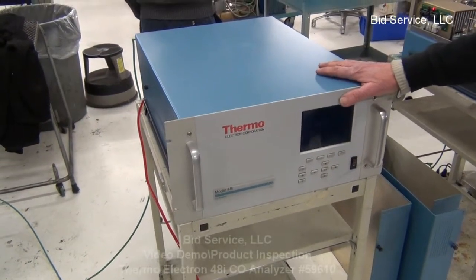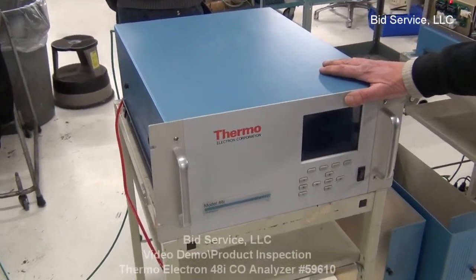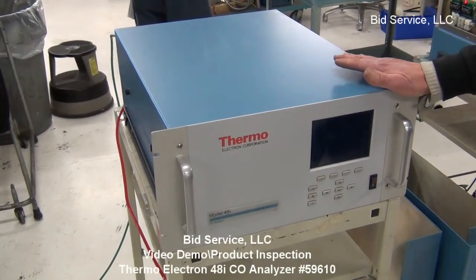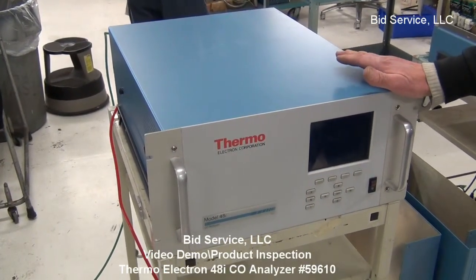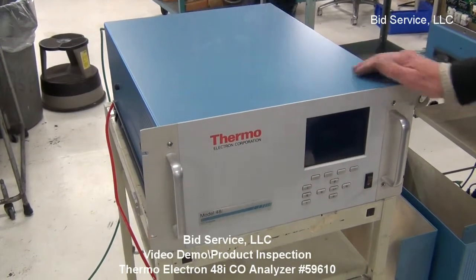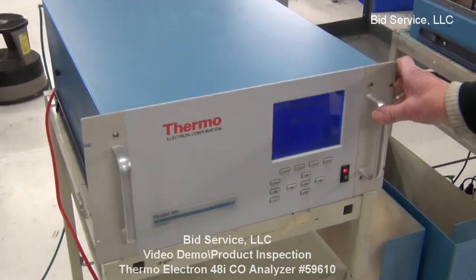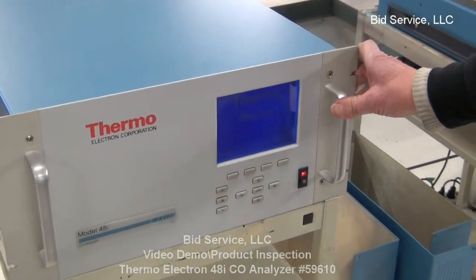This is the Thermo Scientific Model 48I Carbon Monoxide Analyzer, specifically designed for measuring low concentrations of carbon monoxide. It has an initial warm-up period and boot-up period of approximately 55 seconds.